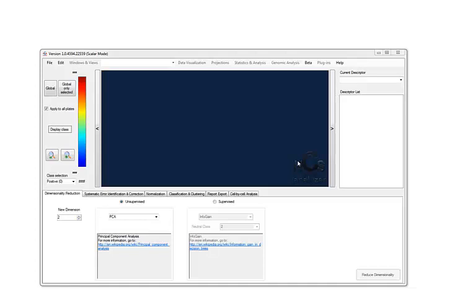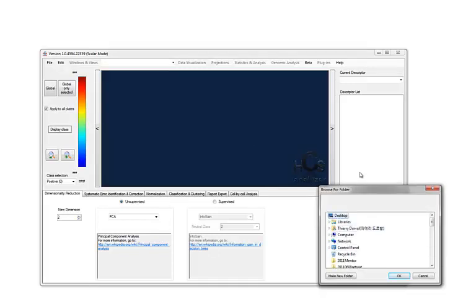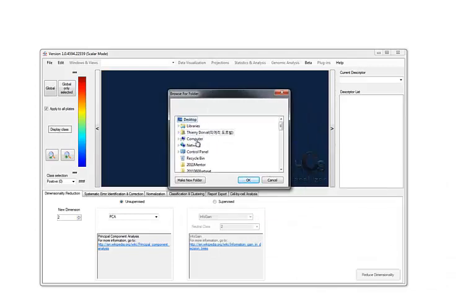Welcome to the HCS Analyzer tutorial for the cell-by-cell data analysis. Previously I showed you how to generate a database based on a CSV file. We will now directly open this database and take a look in this chapter at all the different visualizations of those data. So now, instead of creating a database, we can directly load this database. To do that, just click on Load Database and go directly to the directory where your database has been saved.